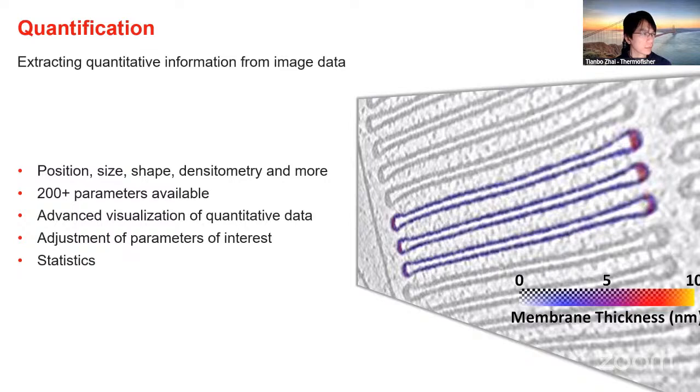They may have a customized measurement they are trying to present, and you try to reproduce the result. Those kinds of quantification processes are also available inside the software, and they are all enabled by a single module called label analysis.